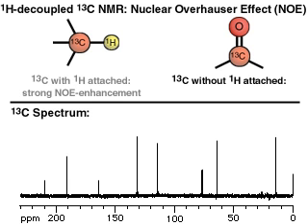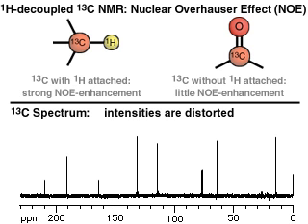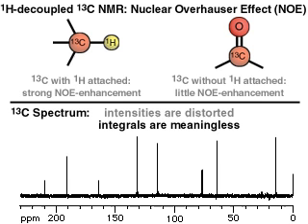Carbons without attached hydrogens, such as carbonyl carbons, experience little NOE enhancement, and therefore give rise to relatively weak signals in the spectrum. This enhancement distorts the intensities in a carbon-13 spectrum and makes integration of the spectrum meaningless.